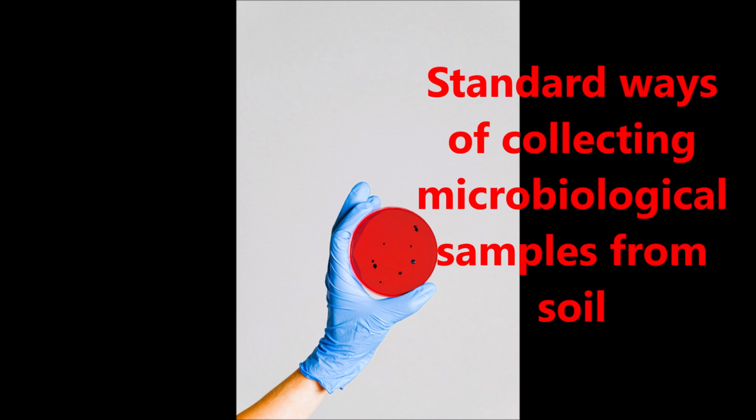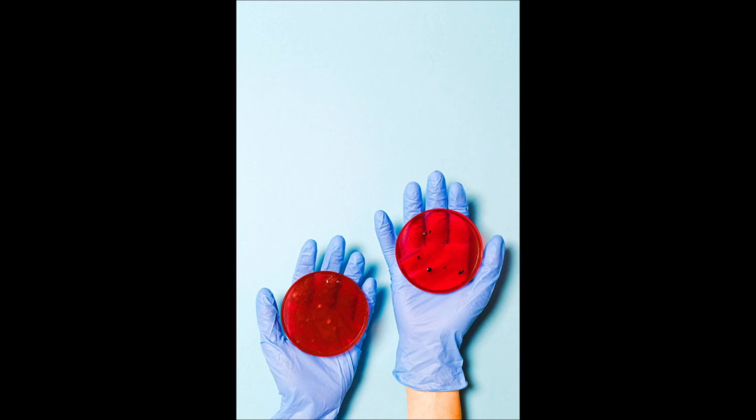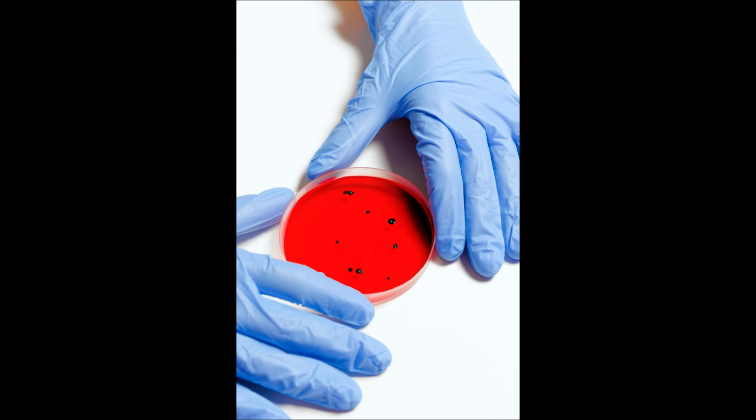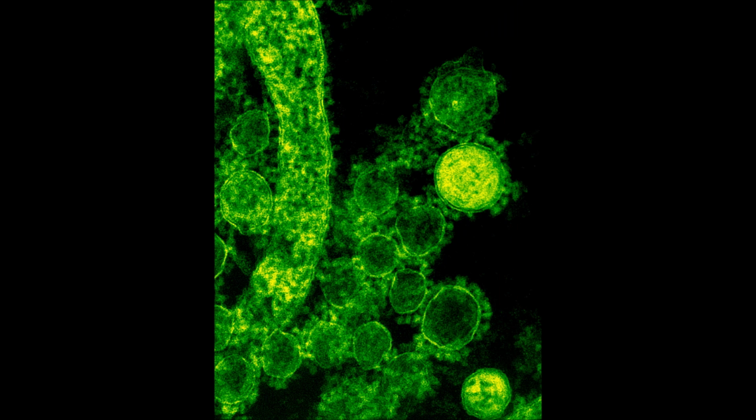So now, how to collect a standard microbiological sample from the soil? It involves different steps, which enable or ensure the sample is representative and free from contamination. So the first step is preparation.